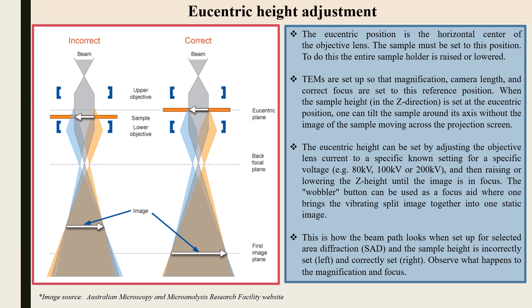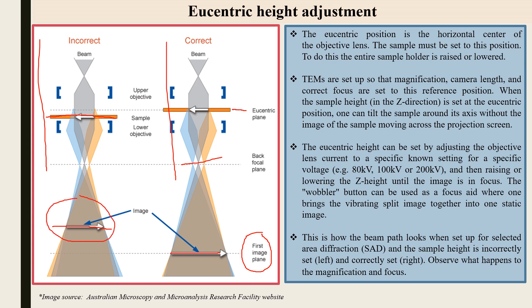Sometimes the wobbler button is used to help set the correct focus. The objective lens current setting depends on the voltage. Looking at the left and right side images: the incorrect case shows the image formed above the image plane. When correctly set at the eucentric plane with the correct crossover at the back focal plane, the image is formed on the first image plane — giving correct focus, correct magnification, and correct resolving power. The eucentric height adjustment is the most important preliminary step.